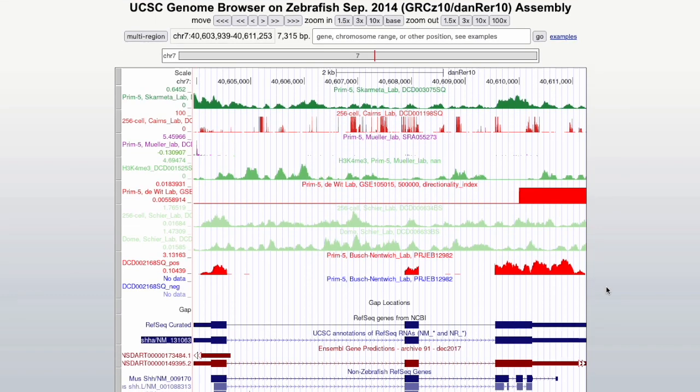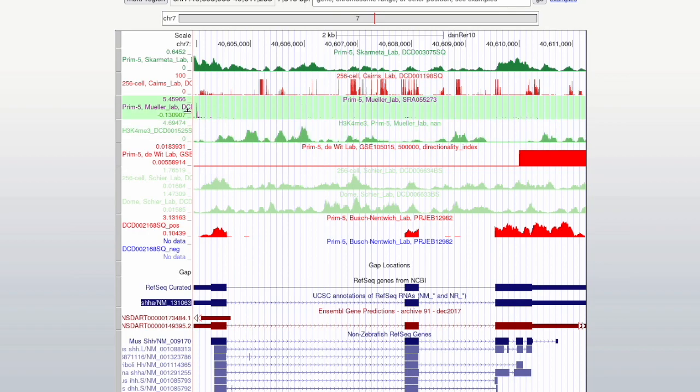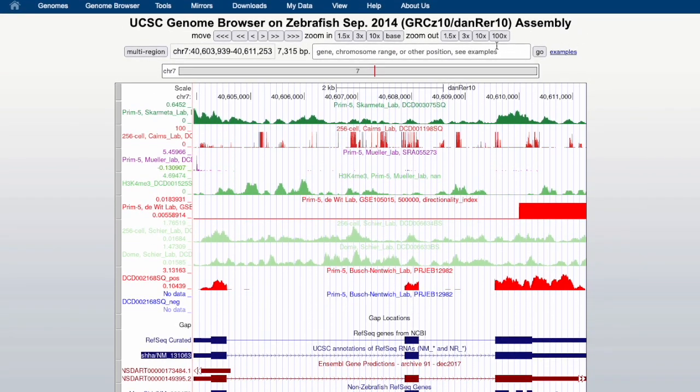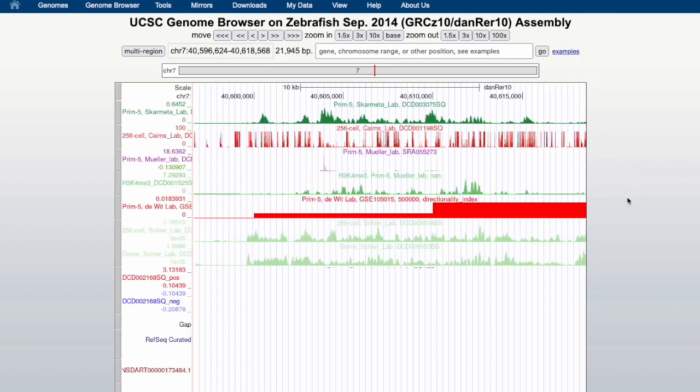Let's go there and here we have now the gene with the reference gene model on the bottom and some of the DanioCode tracks on top. Let's zoom out a bit so we can see the whole gene model.